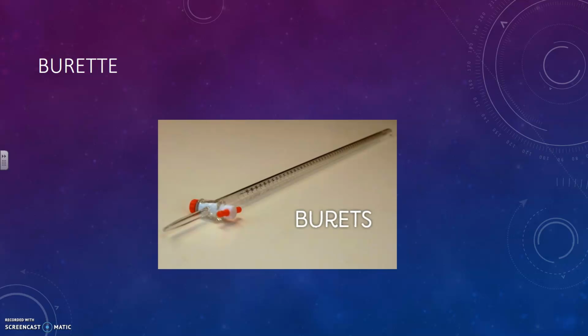You have a burette. So a burette is kind of like a graduated cylinder with a little dropper on an end and then a valve that you can close. Okay, so you can control the flow rate out of a burette. This is used for titrations, and generally I don't use burettes because I hate titrations with a passion. If you would like to know more information about that, you can always ask why I hate titrations so much. But this is a burette.